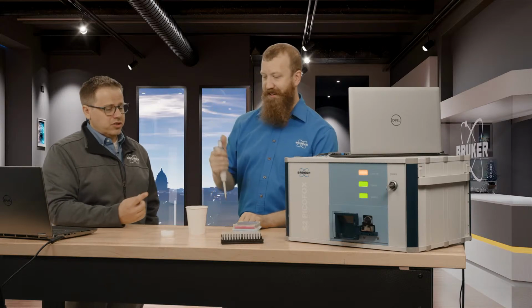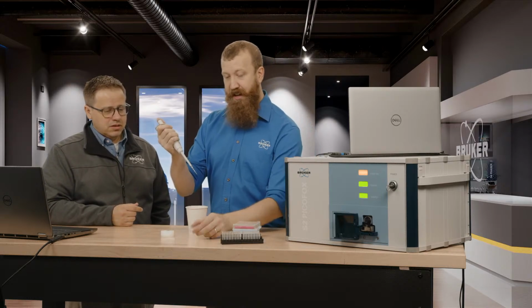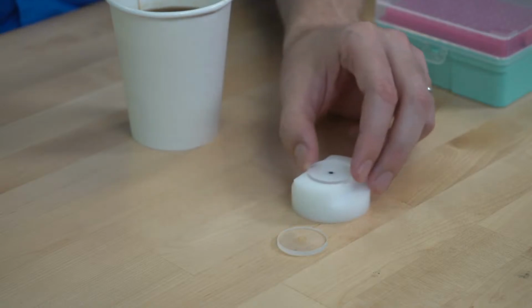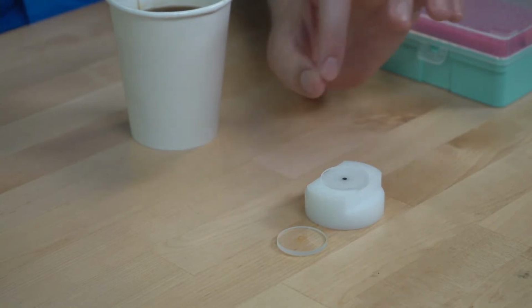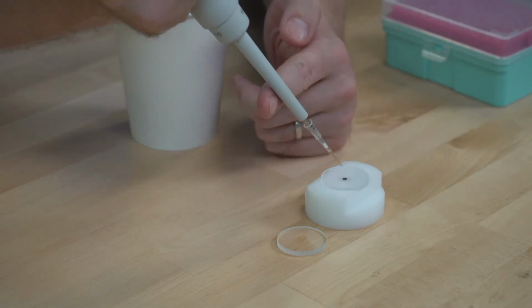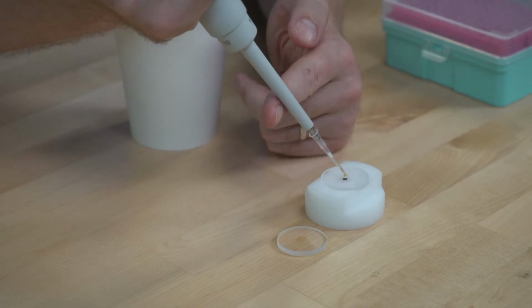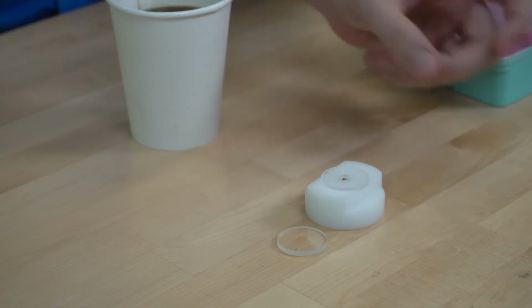All right. So let's go ahead. Now we're going to just take a little bit here. So I have 10 microliters, and then with this slide right here, I place it on the sampling jig. That black spot in the center is the interrogated area. The X-ray hits it along a line, but the sensor is only detectable to that area right there. And I place a droplet, and then I put it on a hot plate and dry it.